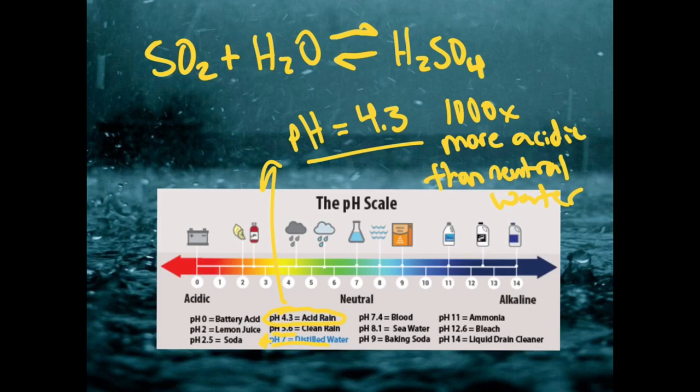So in this lab, we're actually going to be taking a sample of diluted sulfuric acid here, and we're going to run it through a couple different soil types. So we're going to actually experiment with something that farmers in this area do to neutralize the pH of the incoming rainwater as it hits their crops.